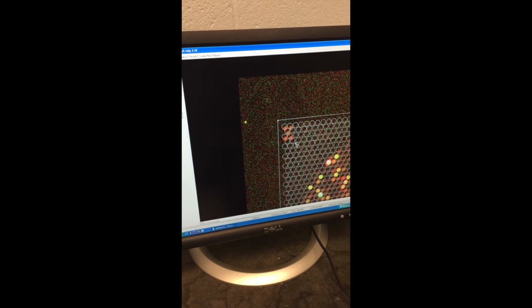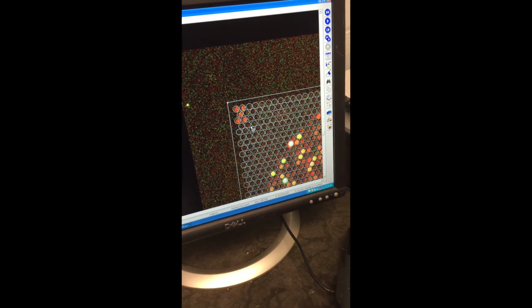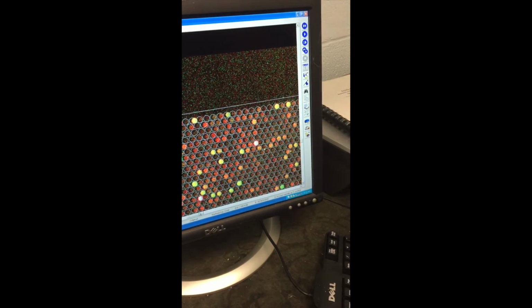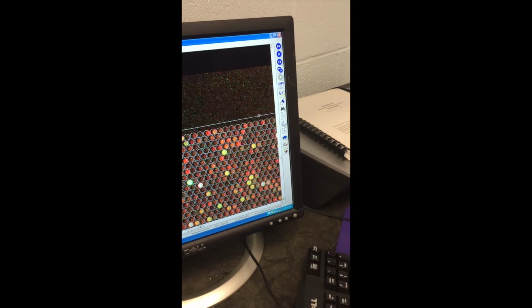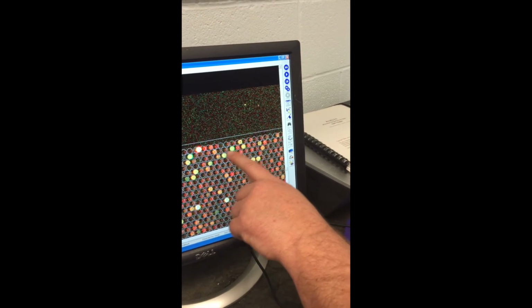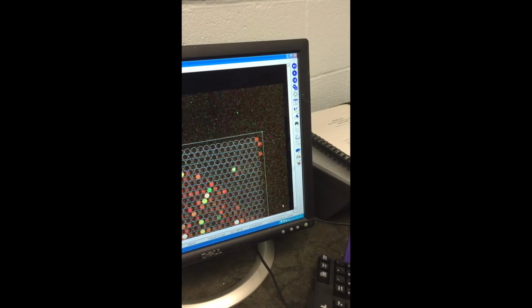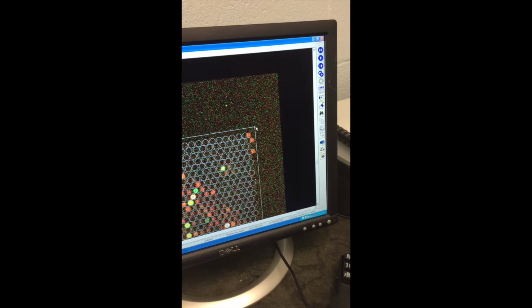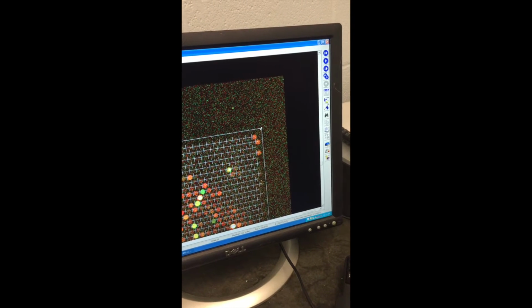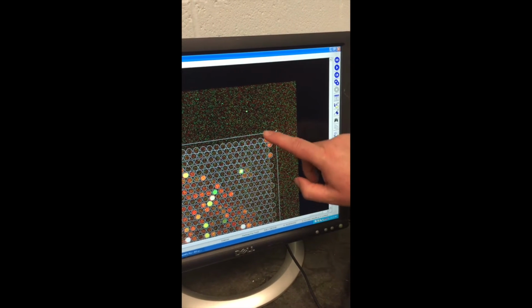I'm going to zoom in to make sure I got it. See, I'm just going to make sure that these 5 fit right there. See that? Now I'm going to zoom over to the other corner, and you can see they're almost lined up, but they're just a little bit over. But you want them to be nearly on top of each other, because each one of these circles represents an address for a gene of interest or potential gene. If you notice, the map is just a little bit off. So I'm going to drag this corner a little bit until it fits these 3 place markers here.